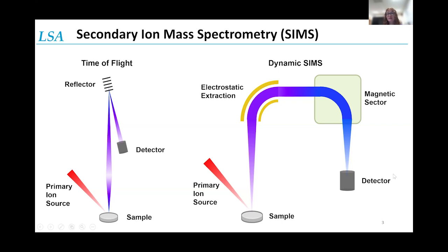So at low mass resolution, about 400 mass units, we can pick elements from indium down to gallium down to silicon, and we are able to do that. We don't have a limit as to how close the elements of interest have to be. So that's just a small difference between 7Fs and your NanoSIMS that some of you may be using.